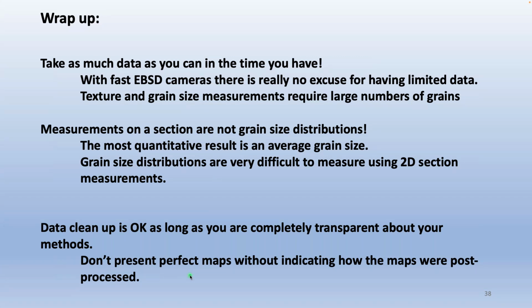Unless you're doing single crystal silicon all day long, which I think I might have gotten one perfect map from, a piece of single crystal silicon with no dust on it or anything else. Generally, there's at least one missing pixel.